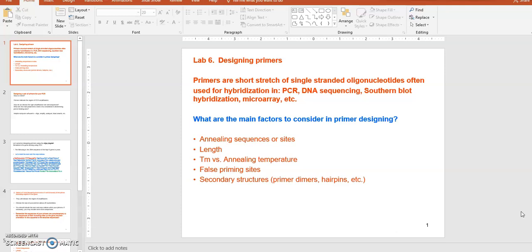And I already told you about false primer binding sites and random binding sites being the same thing. Any site where your primer binds at less than 100% is a false primer binding site. Your primer is designed to have the matching sequence to its target site, 100% match, right? But if your primer binds with a random site at less than 100% match, maybe 20%, 30%, 40%, 50%, then we call those random priming sites. So you can eliminate those by using the higher annealing temperature.